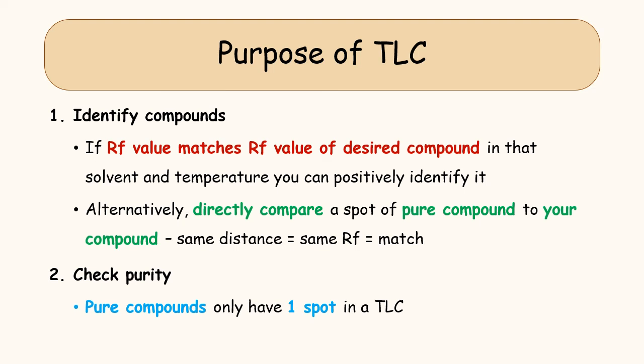So TLC is used for identification and checking purity. That has been our short video on TLC.